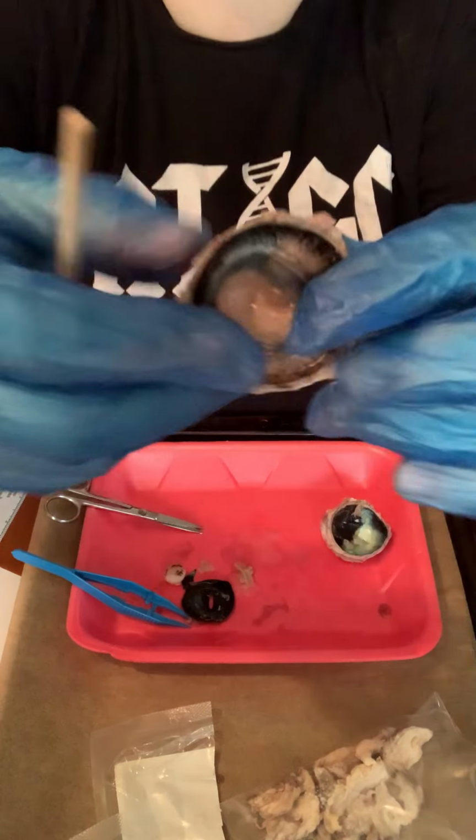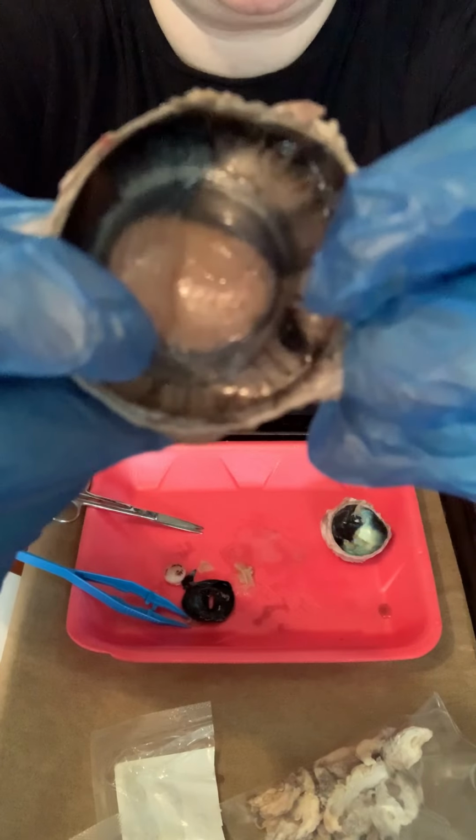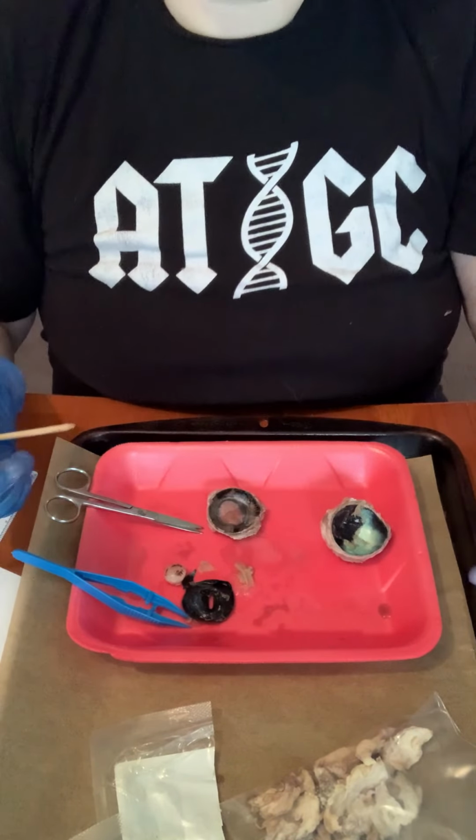Looking at the top half of the eye, we're going to see the same thing right around the edges. The sclera, the whites of the eye. Okay, so there you have it.